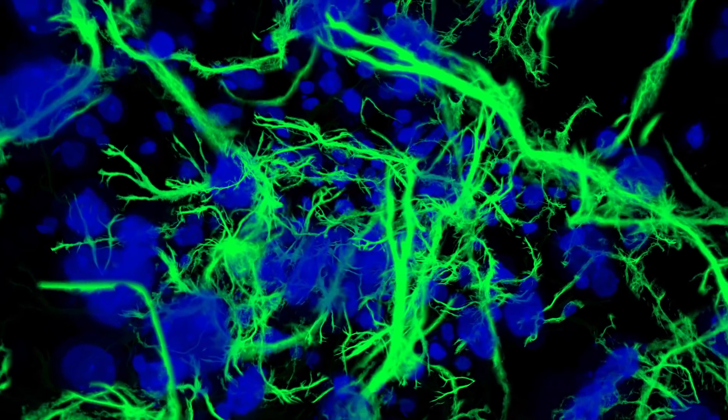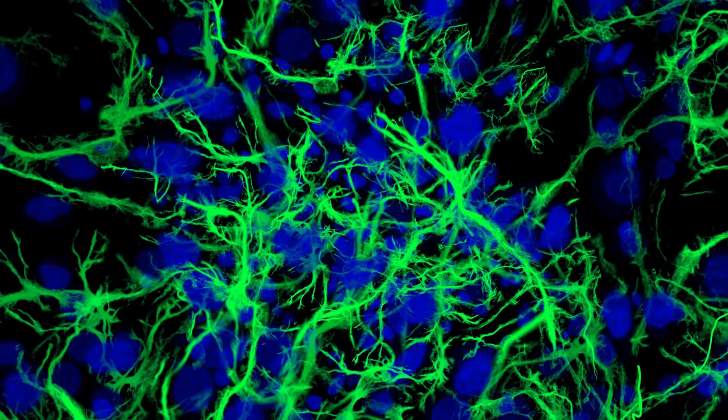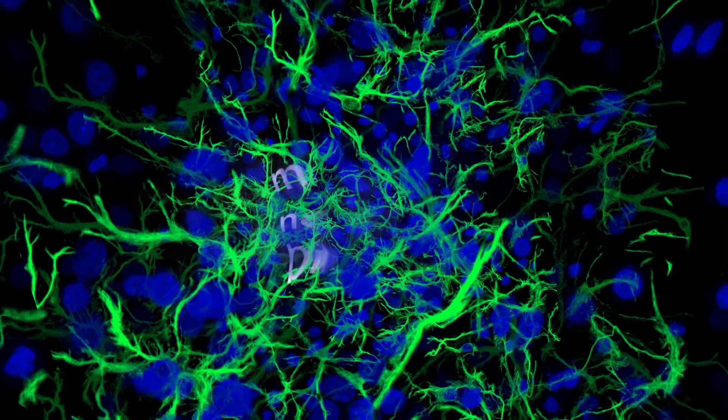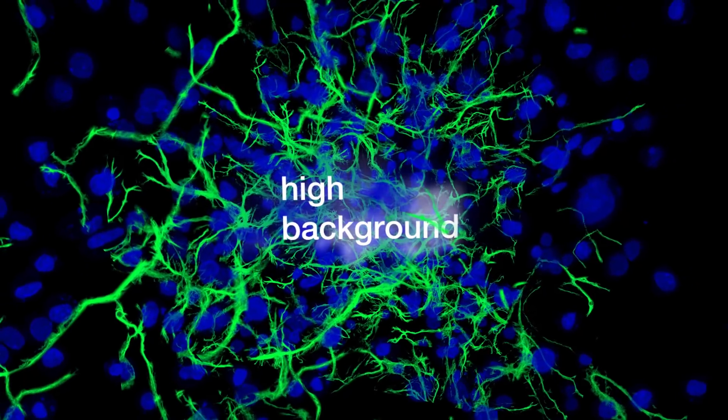Cross-absorption means these antibodies filter out unwanted targets so that the antibody only binds to the correct species. It minimizes non-specific binding and minimizes high background.